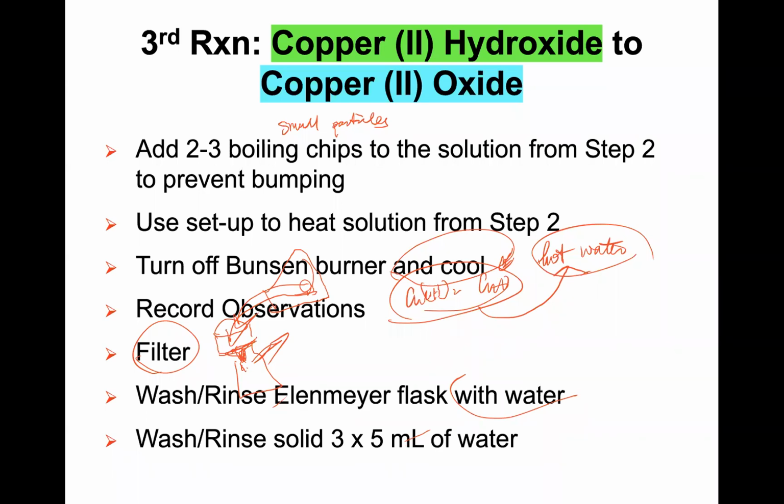Remember you have excess hydroxide in your solution. In this case, we will wash away the residual sodium hydroxide, because in the next step you will use acid to react with that. If there's sodium hydroxide, it will consume some of your acid, right?